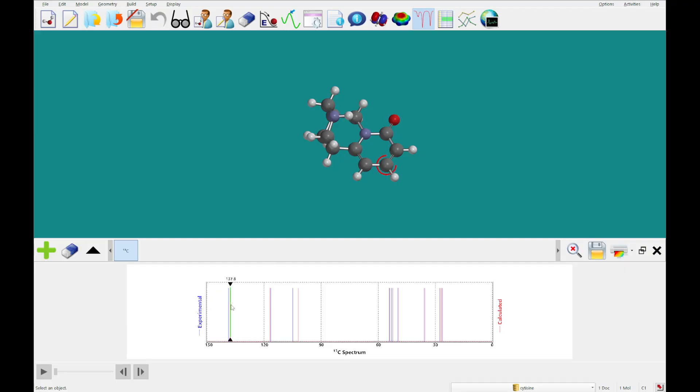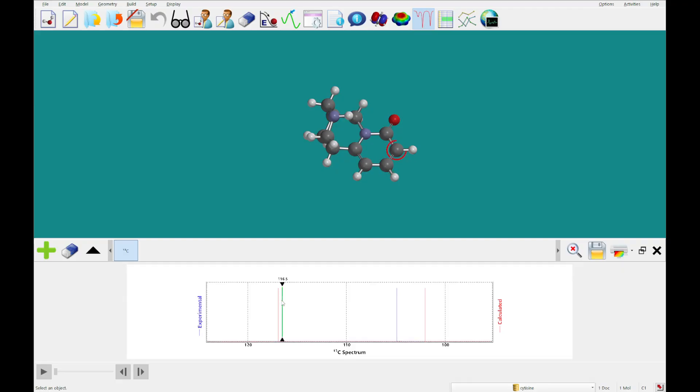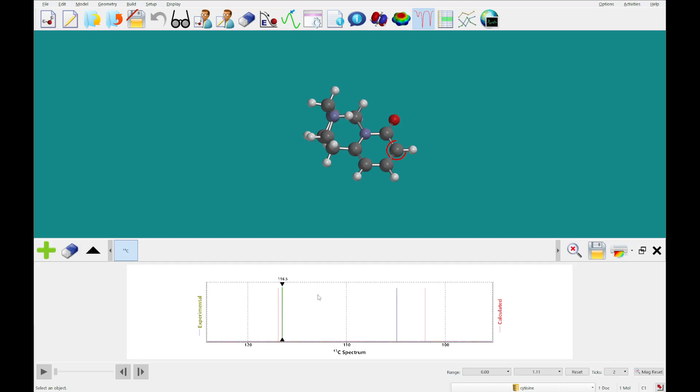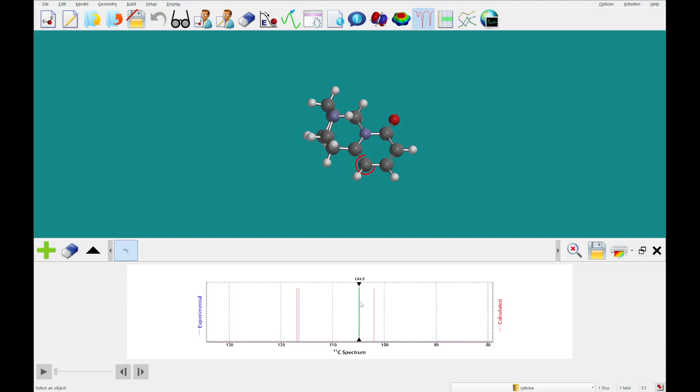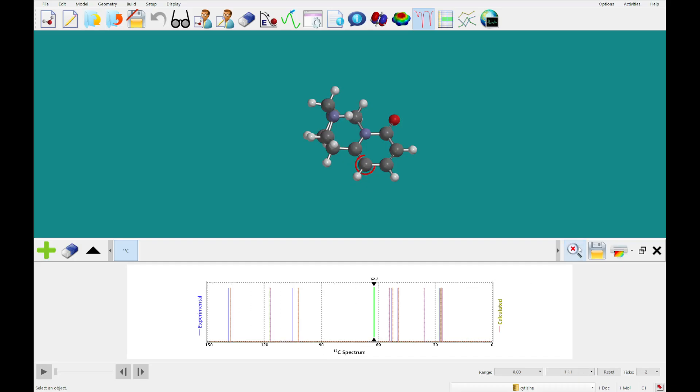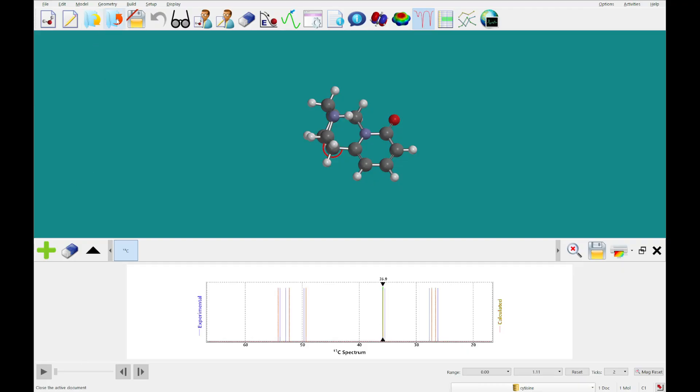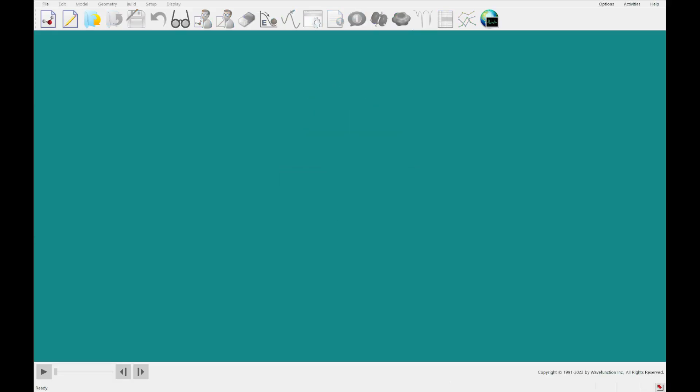Alright, so each one of these lines will correspond with one of the carbons, as you can see there. Whether you click on the experimental line or the calculated, you'll see the corresponding carbon with this sort of target going around it. Alright, so moving on, we're going to close out of this.